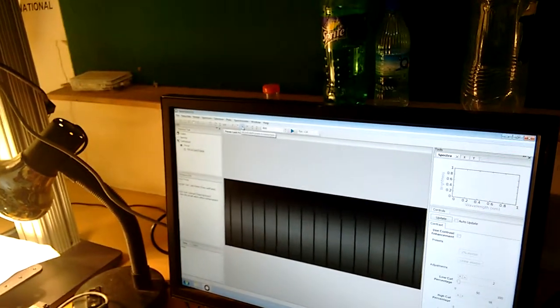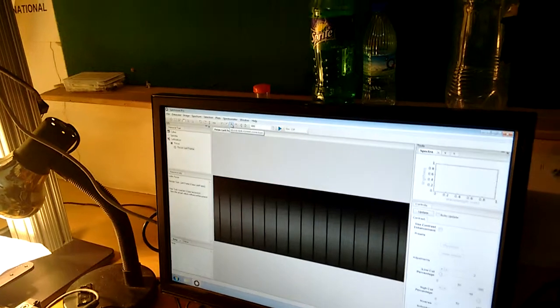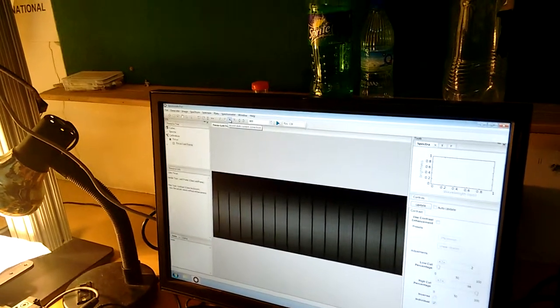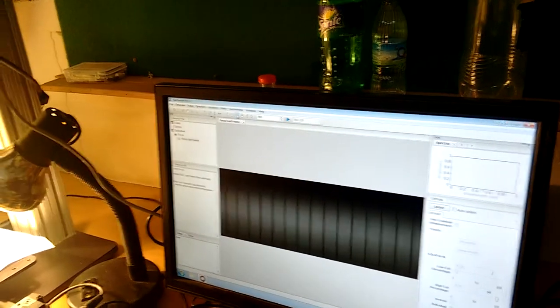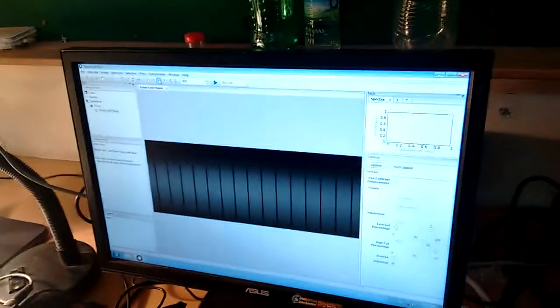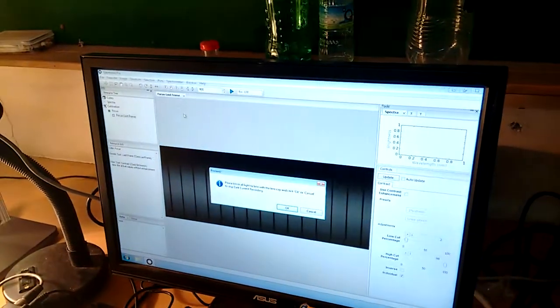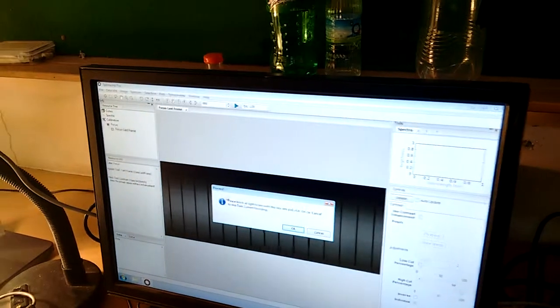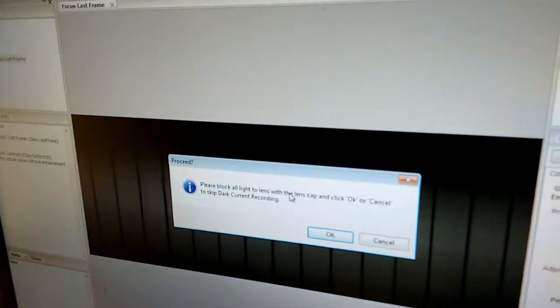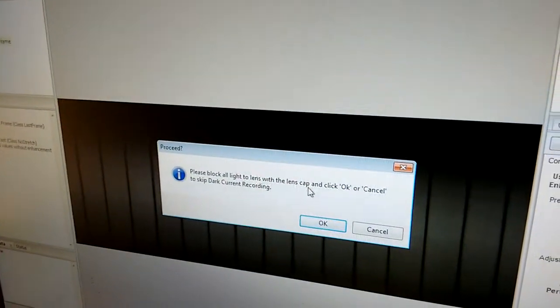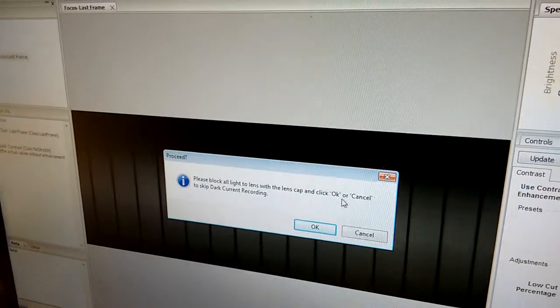Now I have to record the dark spectrum from this place. So I'll block my camera with the cap and I click on dark. It gives me a warning, please block all the light to the lens with the lens cap and click OK.